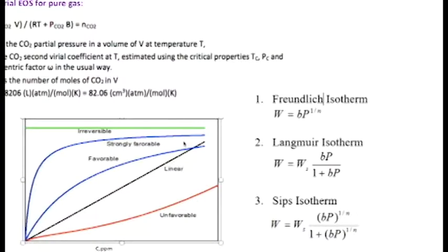The amount of gas adsorbed on the activated carbon can be quantified at this equilibrium state using the virial equation of state that relates known quantities and measured quantities such as the pressure, volume, and temperature, and this will enable us to calculate the number of moles of gas.